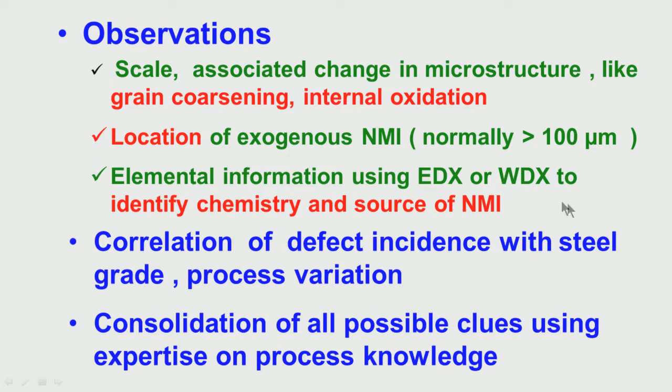This analysis is done in SEM by EDX or WDX. These are small locations. You cannot do normal chemical analysis, because what will it give you? It gives you information from a large area, so that will not be adequate. We want to analyze a localized area under the scanning electron microscope.